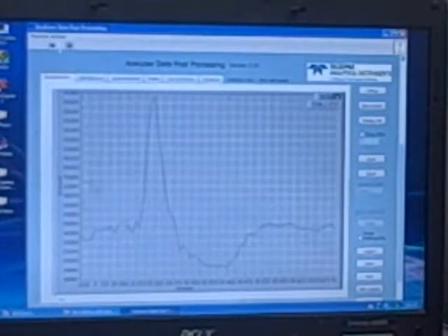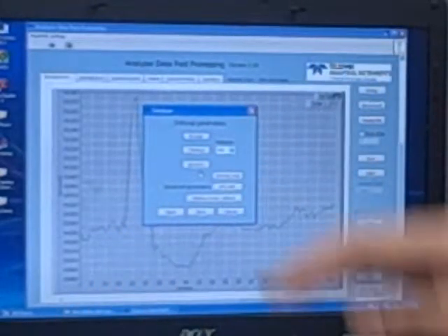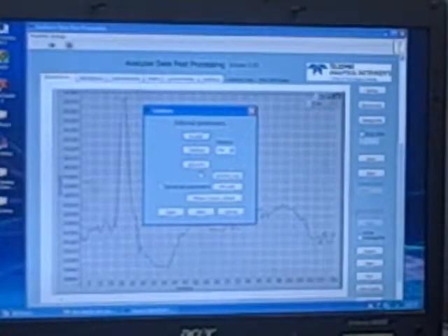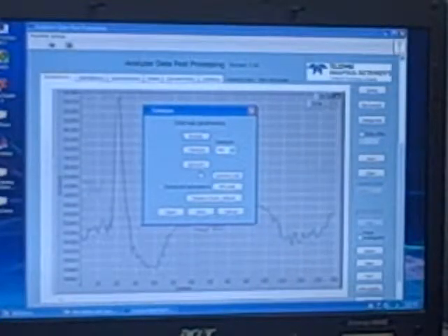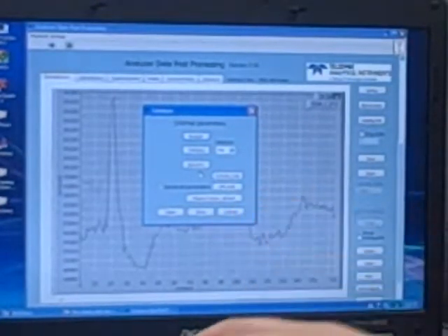Second step, go to parameter setting. Click internal setting. It opens a new page. It shows you three most important part of the internal settings. I called the gas and the temperature as an external setting. And anything inside the panel called internal settings that cover most of them is called range, timing, and group.